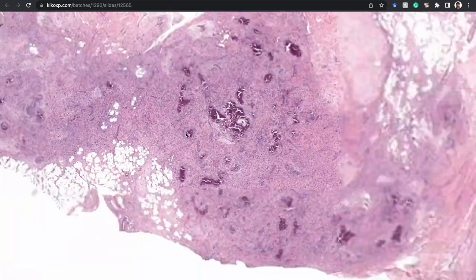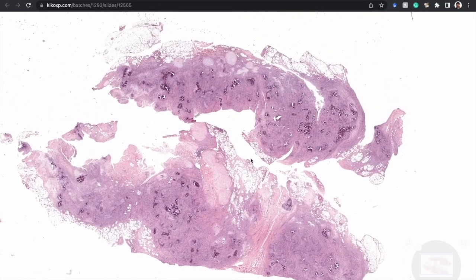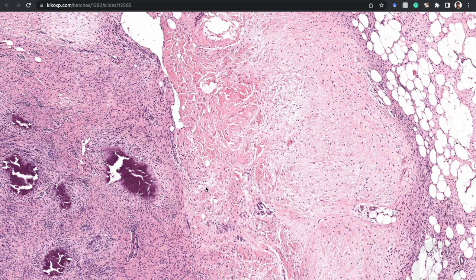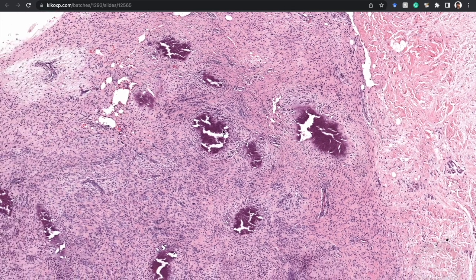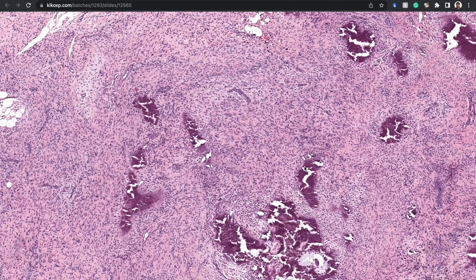They're often infiltrative at the borders, as you can clearly see here, and because of that they do have a propensity for local recurrence. Sometimes years later — I saw one that initially was thought to be a chondroma because it had an abundant cartilage component. Sometimes these can have some cartilage component in with the areas of calcium.